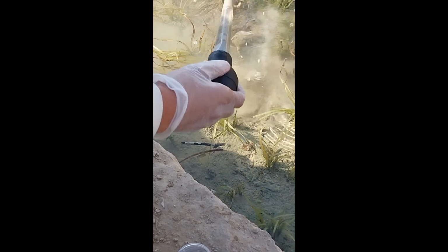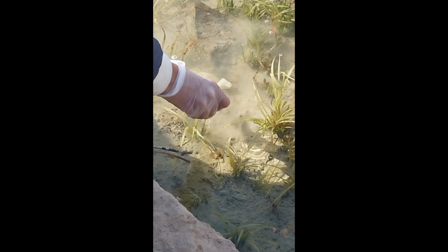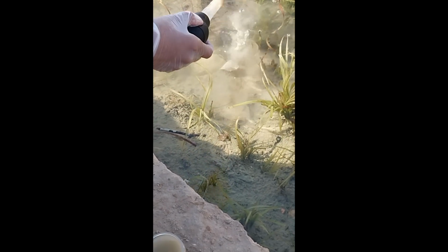I also used this baster to collect some sediment and place it in a jar. Sediment from a freshwater body contains a lot of microorganisms, including ciliates, nematodes, and diatoms.